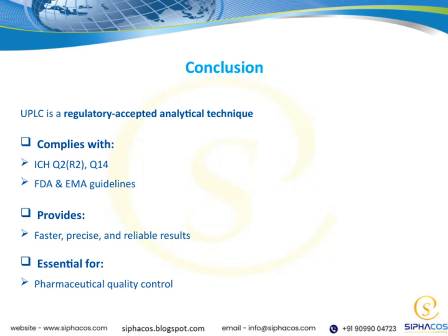What's really great about UPLC is that it provides faster, more precise, and highly reliable results compared to some traditional methods. This speed and accuracy are crucial, especially when it comes to maintaining high quality in pharmaceuticals. Ultimately, UPLC plays an essential role in pharmaceutical quality control, helping ensure that products are safe, effective, and consistent.